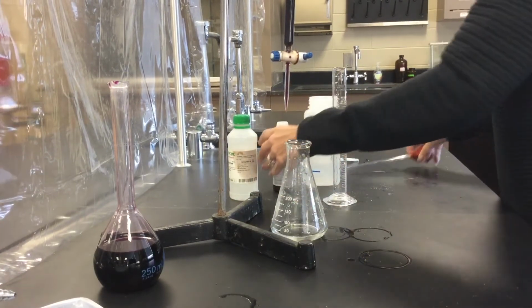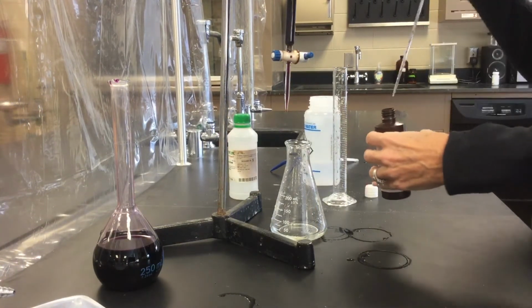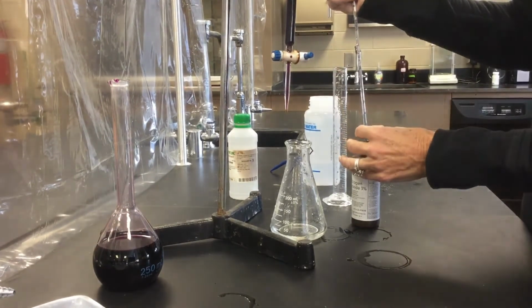Okay, and then our baby pipette to do 1 milliliter of our hydrogen peroxide.